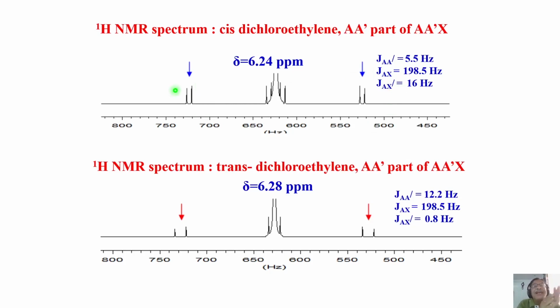These are called satellites in NMR. I wanted to explain this later, but since I took the example, I had to explain it now. Take an example of CHCl3. Single proton, you shall get one peak. 99% is carbon-12 attached, so there is no other coupling, you get a single peak. But there is 1% of the molecule attached to carbon-13. That will couple to the proton.